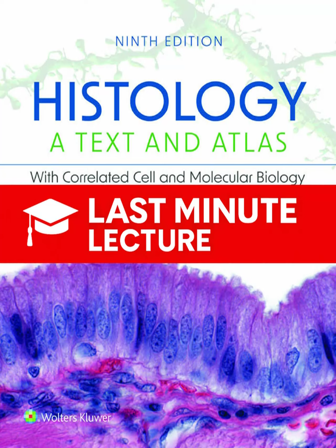Instead of the electrons passing through the specimen, the electron beam is scanned across its surface. Detectors then collect the electrons that are reflected back or knocked out of the surface to generate a high-resolution, three-dimensional topographical image. The resolution is a bit lower than TEM, but the 3D rendering is incredible. It is. The preparation involves fixing and dehydrating the sample and then coating it with an electrically conductive layer, usually a gold carbon film, to prevent charge from building up.